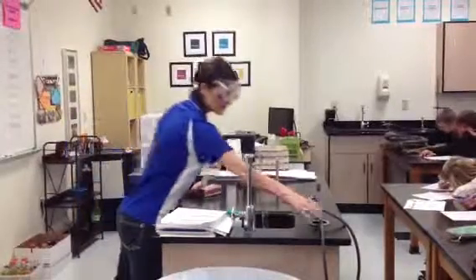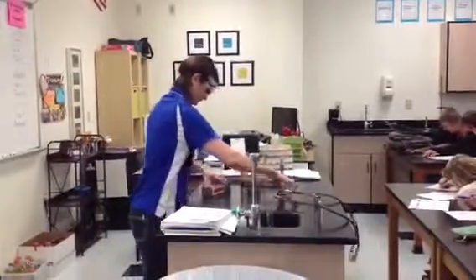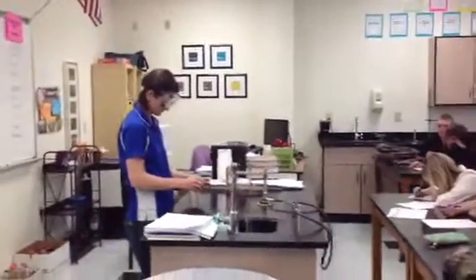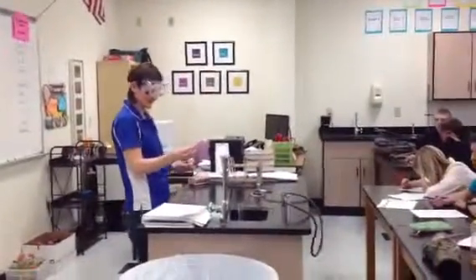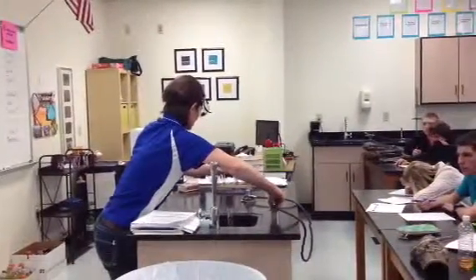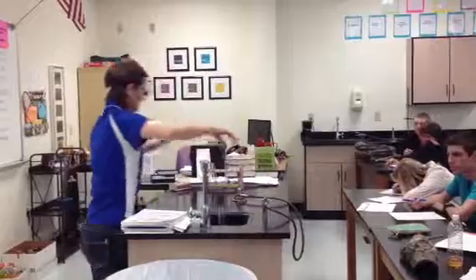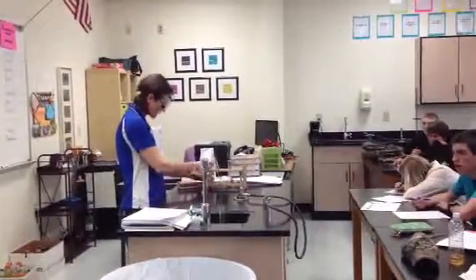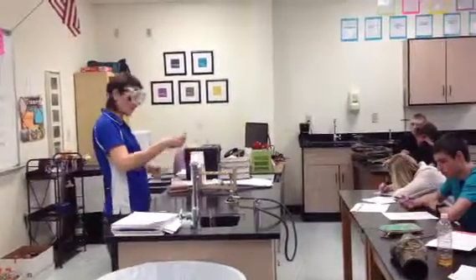Okay, got my gas on, I'm going to light my burner. Those things always confuse me. What's confusing? The flame's either gigantic when I light it or really small. People mess with the burners. There you go, hers is always set. Yes, it is. Alright, so here's my copper 2 carbonate.